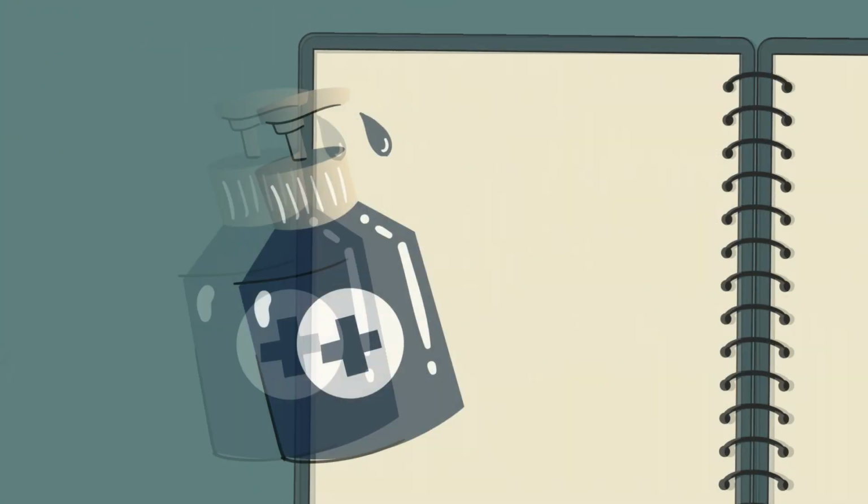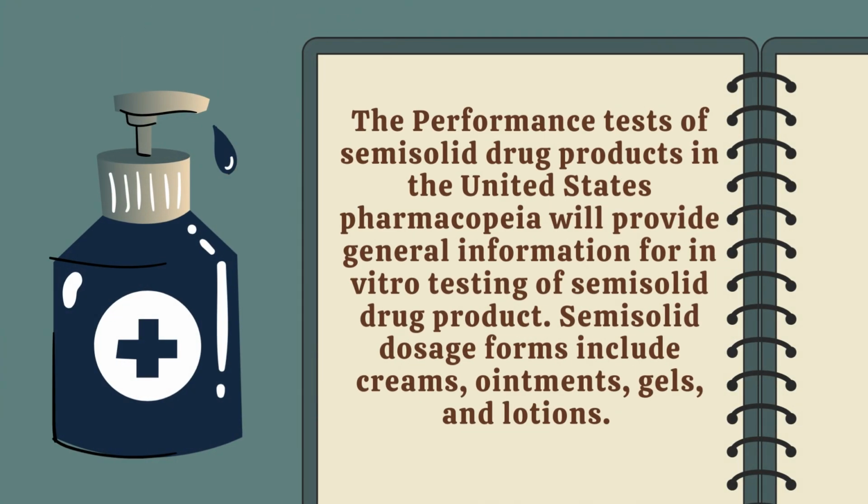The performance test of semi-solid drug products in the United States Pharmacopoeia will provide general information for in vitro testing of semi-solid drug products. Semi-solid dosage forms include creams, ointments, gels, and lotions.